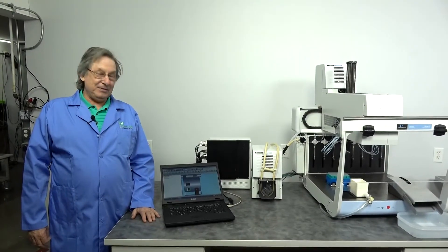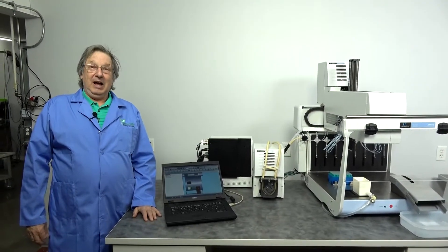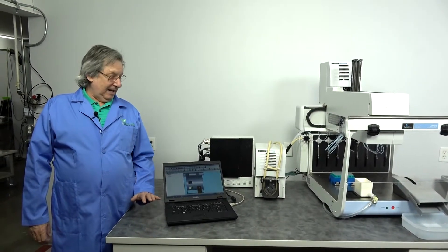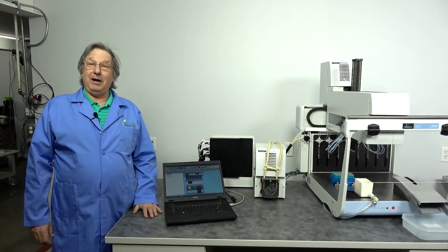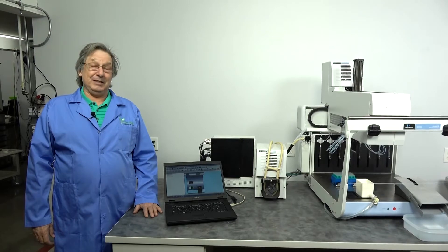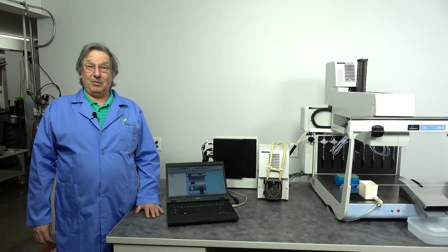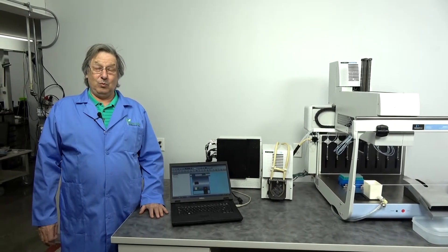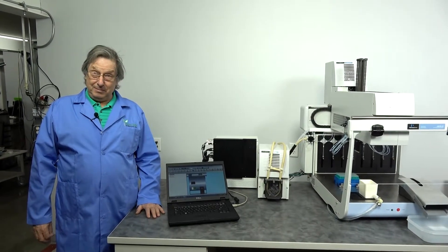Hello, welcome to New Life Scientific. Today we're going to be talking about the Janus Liquid Handling System.